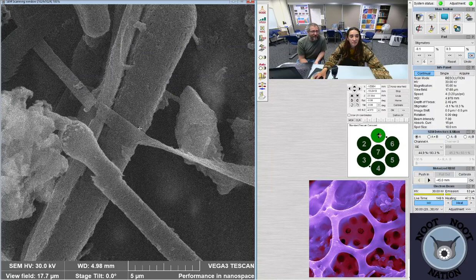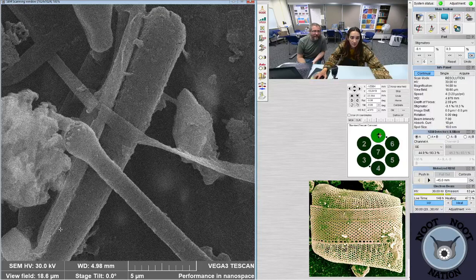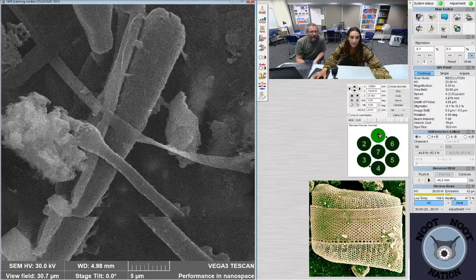Okay. See how you can see the lineolate striae? Mm-hmm, yes. And then the girdle band? This one. And then the lineolate striae on the other valve. Mm-hmm. I would guess it's probably cymbella, or not cymbella, navicula.